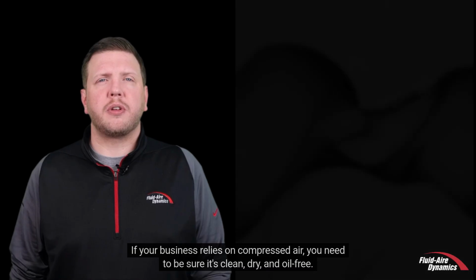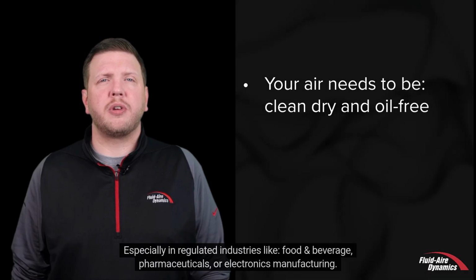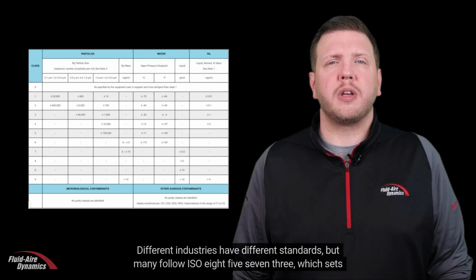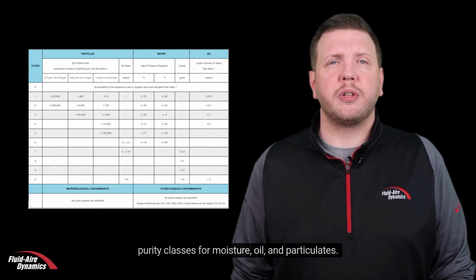If your business relies on compressed air, you need to be sure it's clean, dry, and oil-free, especially in regulated industries like food and beverage, pharmaceuticals, or electronics manufacturing. Different industries have different standards, but many follow ISO 8573, which sets purity classes for moisture, oil, and particulates.